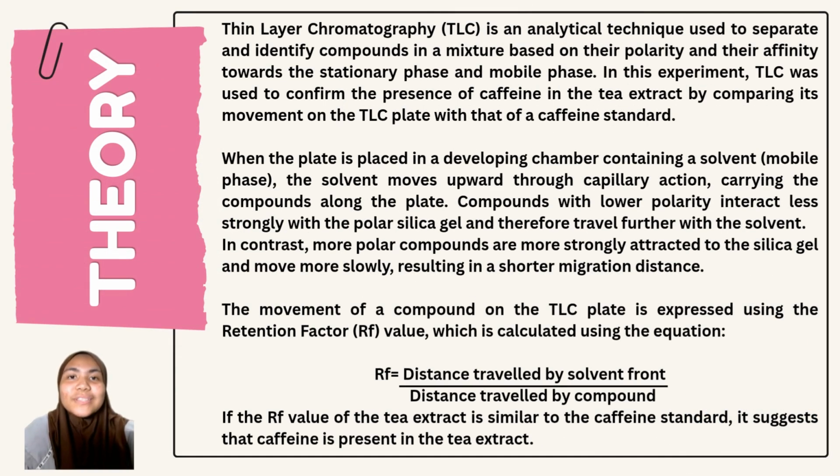Okay, now let's move on to the theory. Thin layer chromatography, or TLC, is an analytical technique we use to separate and identify compounds in a mixture based on their polarity. In this experiment, TLC was used to confirm the presence of caffeine in the tea extract. This was done by comparing the movement of the tea extract with the caffeine standard on the TLC plate. When the TLC plate is placed in the developing chamber containing a solvent, the solvent moves upward through capillary action.